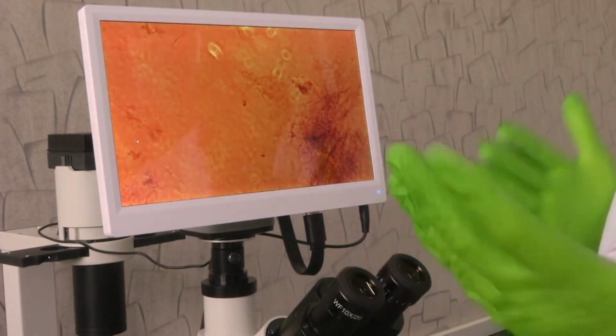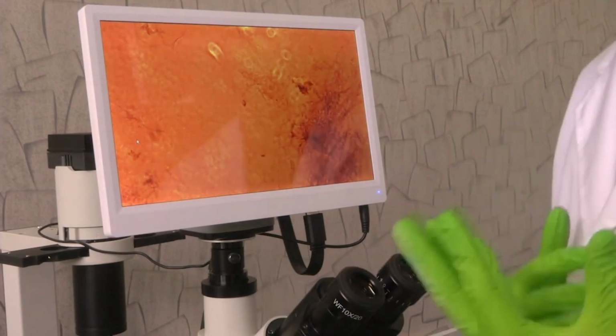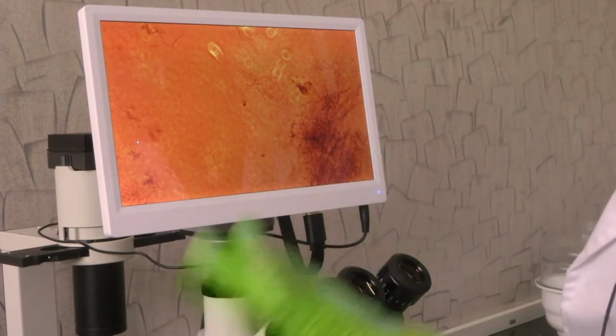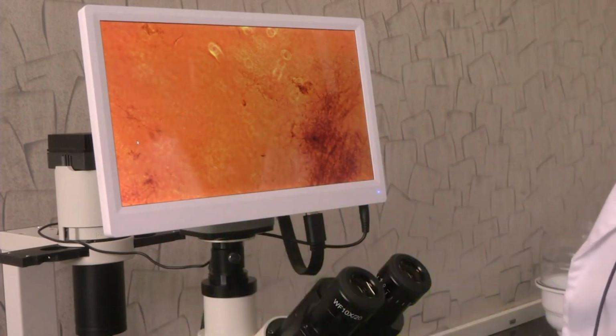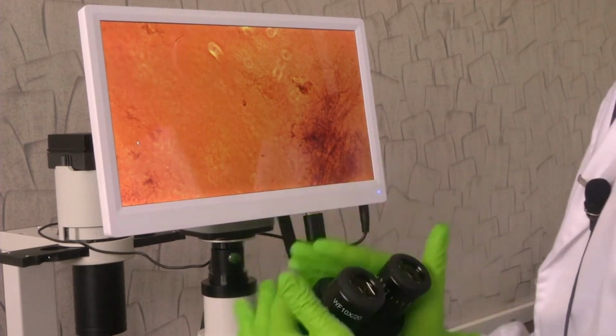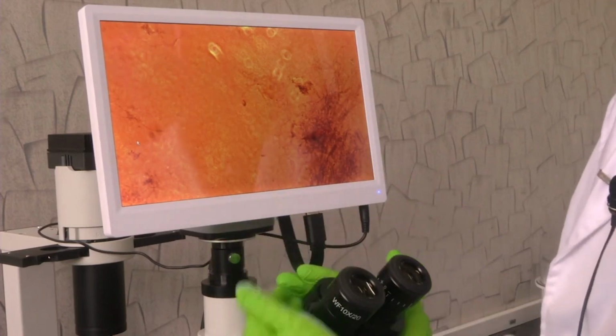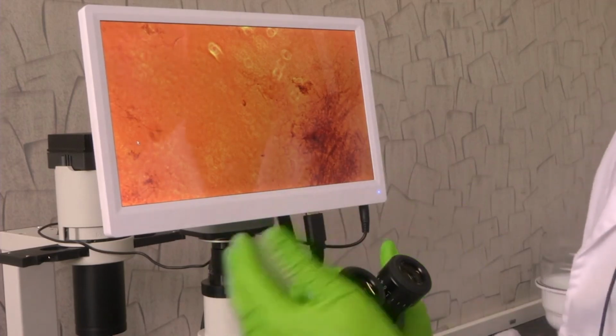These will vary between different models of inverted microscopes, but the core idea, the core philosophy of the microscope remains the same. Hope all of you have got a good idea about how the inverted microscope works. It is very important, and this is a fundamental equipment in any laboratory that wants to work in the biology or medical field and also work with engineering.